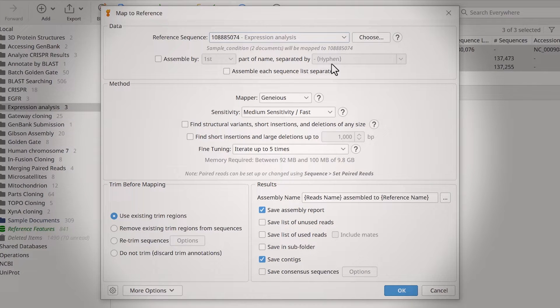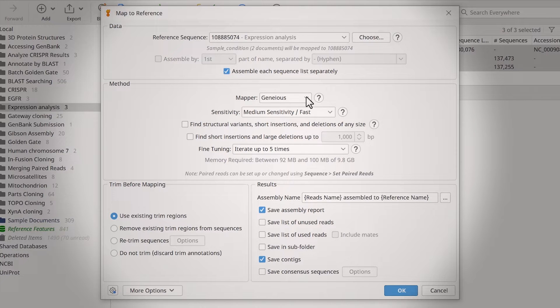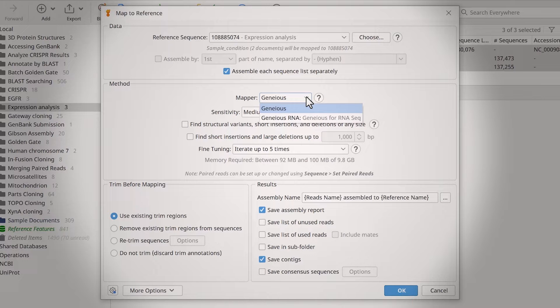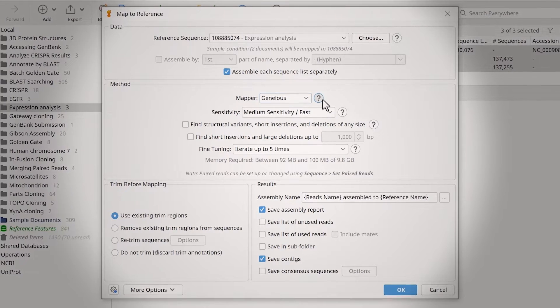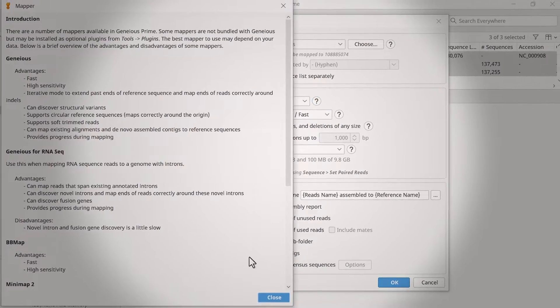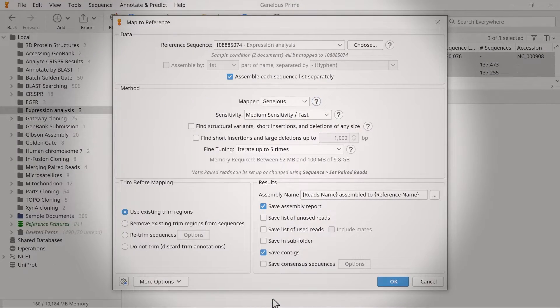If you're assembling more than one set of reads, you can choose to assemble each file separately by selecting this option. In the Methods section below, specify the mapper you wish to use for the analysis. There are numerous mappers available in Genius, each with its pros and cons. To learn more about these, click the Help button. For this example, I will leave these settings as default.